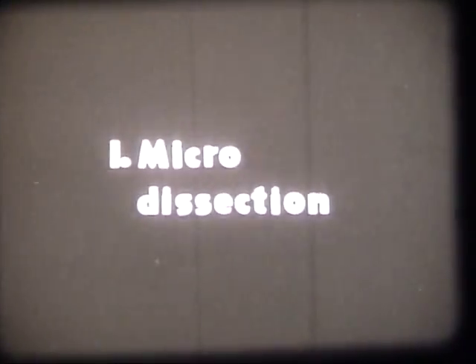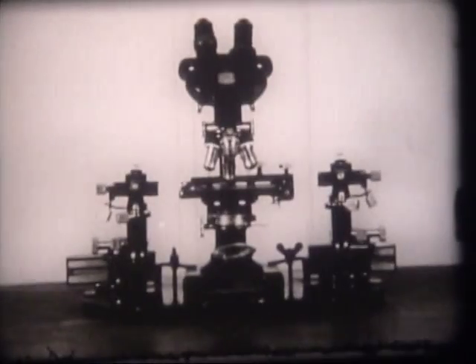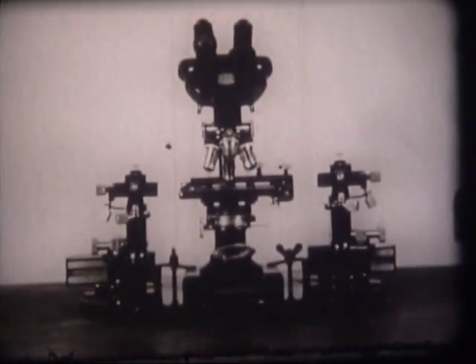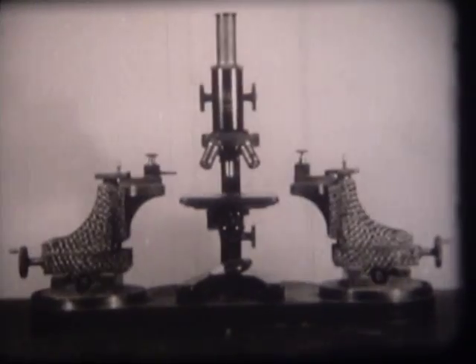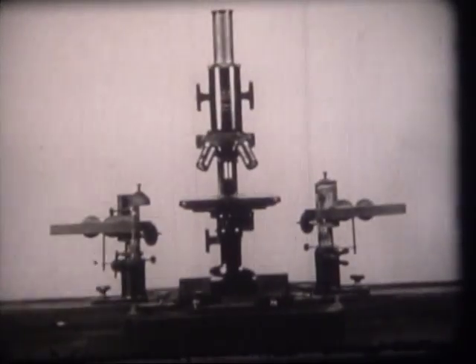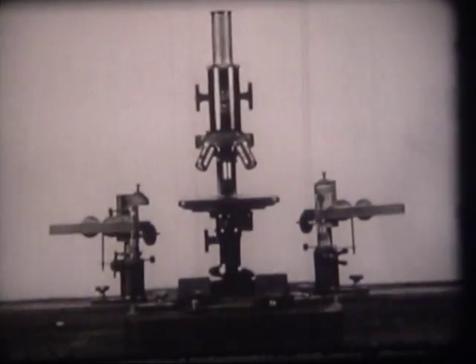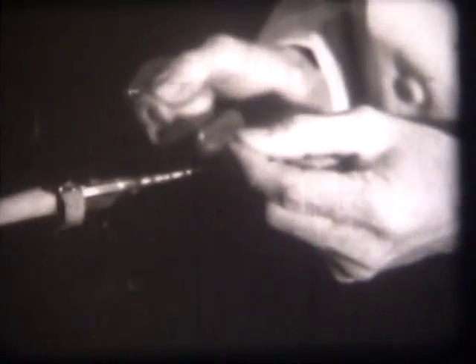We shall now indulge in some work in microdissection. Here are several types of micromanipulators in which glass needles are clamped and controlled. Our problem is to prove that protoplasm is elastic. We prove it by tearing protoplasm with needles, just as a surgeon dissects the human body. And for this operation, we must have a pair of delicate needles made either in a tiny flame, such as this, or better yet, with the aid of a hot platinum wire.